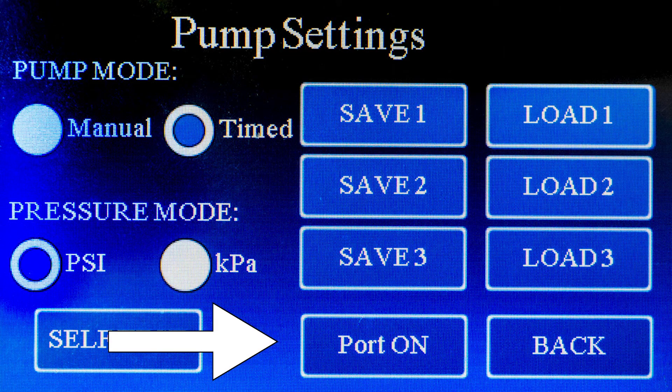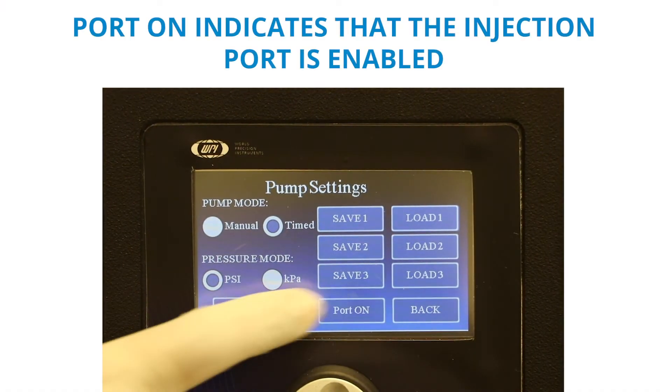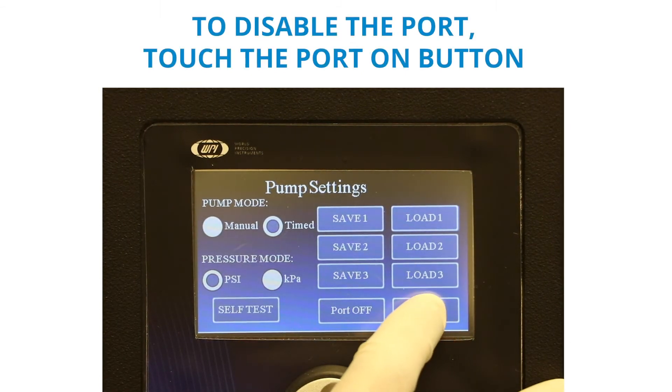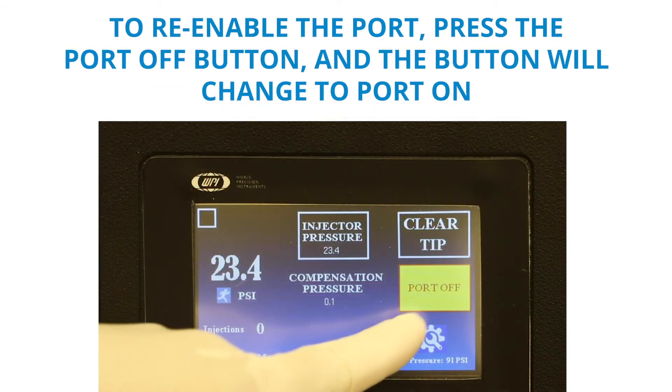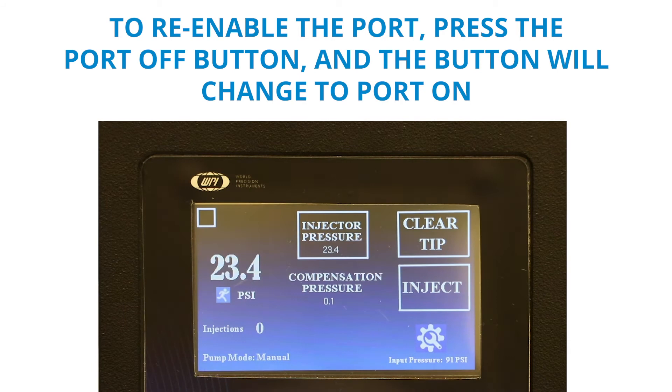The port status button indicates when the pressure port is enabled. Port on indicates that the injection port is enabled. To disable the port, touch the port on button — the button will change to port off. To re-enable the port, press the port off button again, and the button will change back to port on.